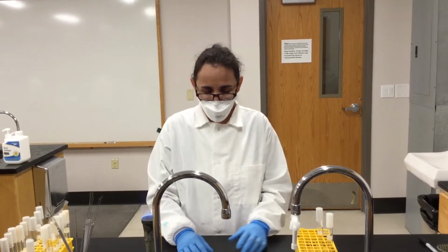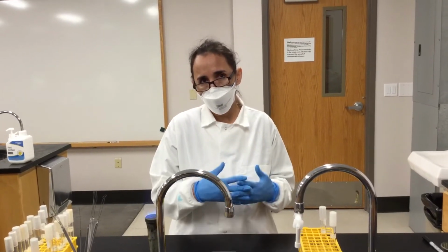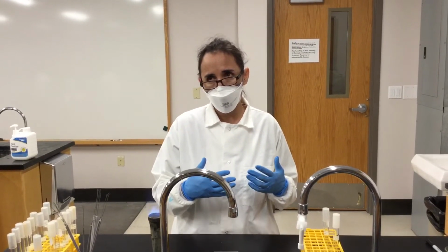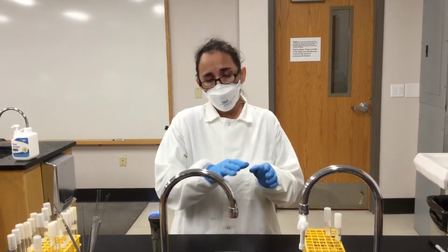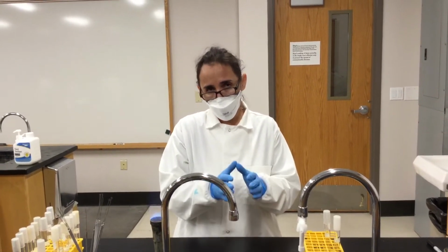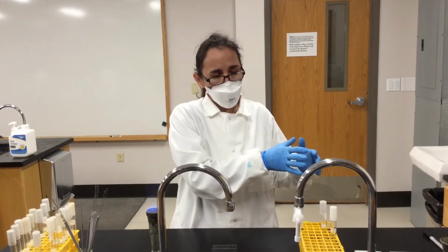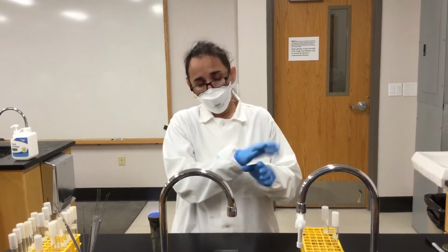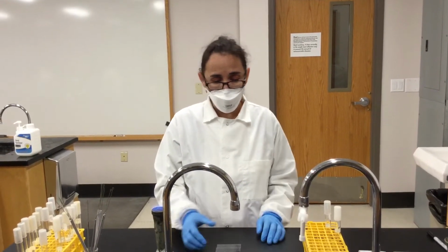Now, in negative stain, the charge of the dye is negative. So that's why it's called negative stain. Since you have negative charges in the cytoplasm and you have a negative dye, the dye will not penetrate the cell, so you stain the outside of the cell.